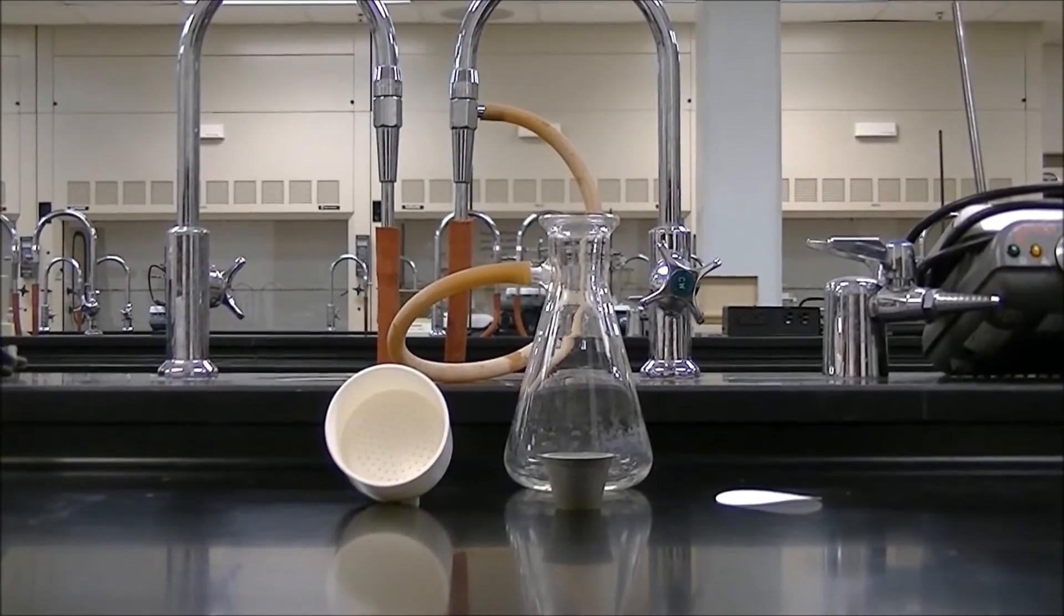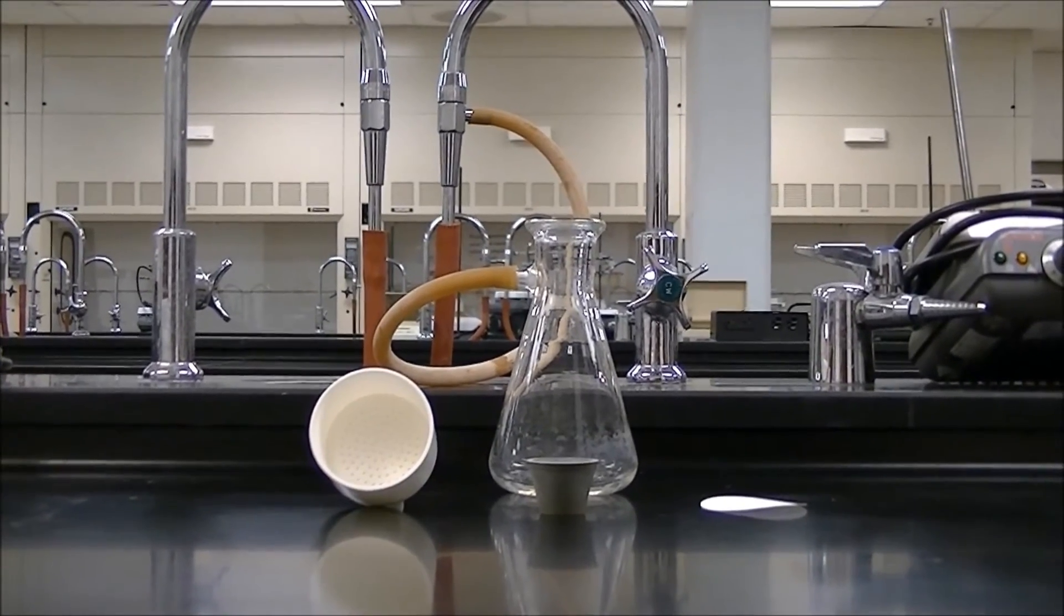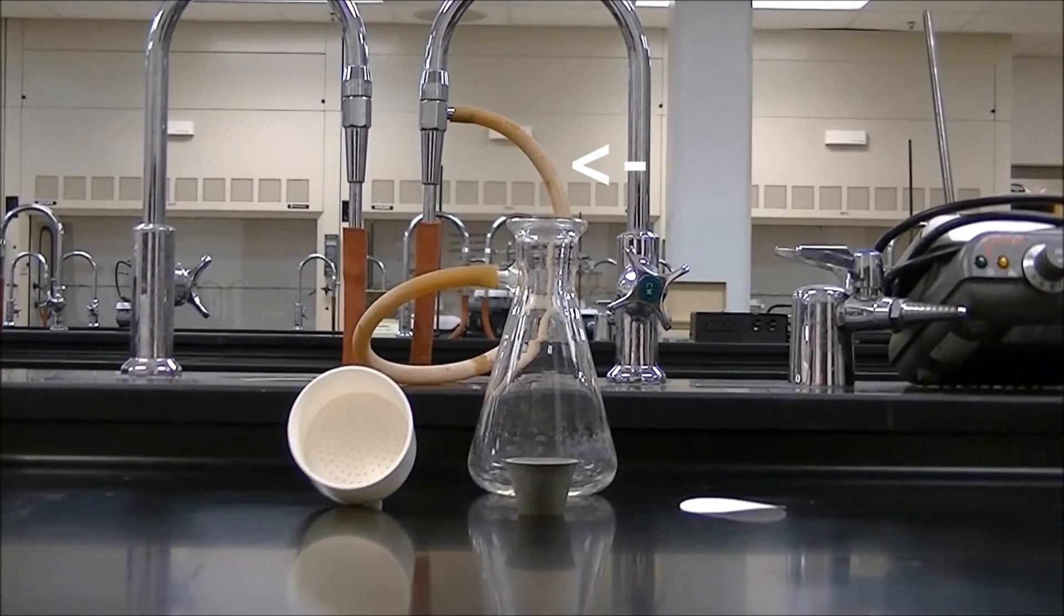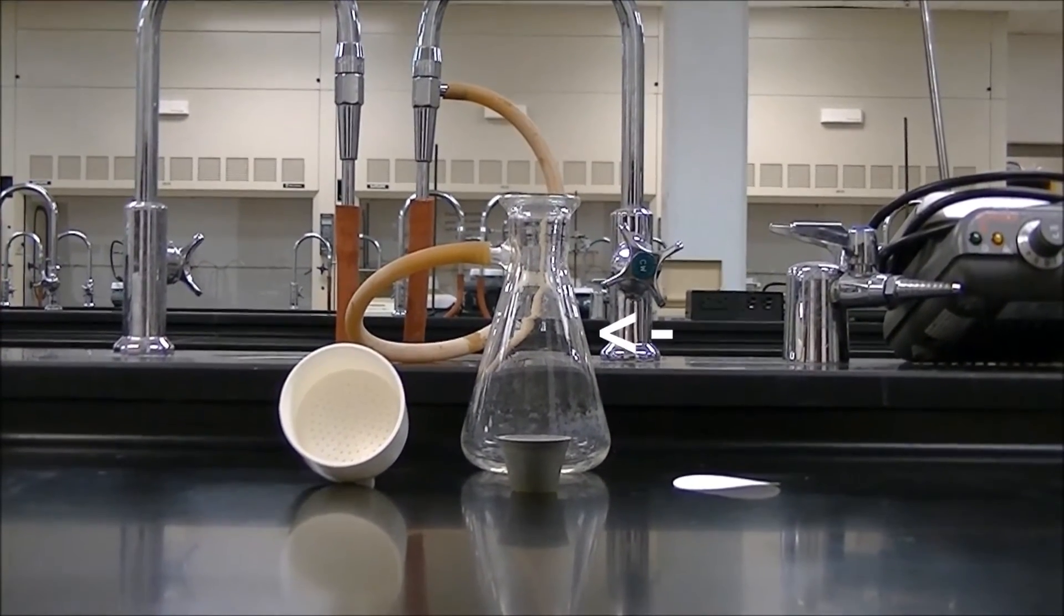Now we're going to set up a filtration apparatus to catch our ethyl-4-aminobenzoate solid. You'll need a Buchner funnel, a rubber adapter, a hose that will attach to the faucet, a piece of filter paper, and a filter flask.